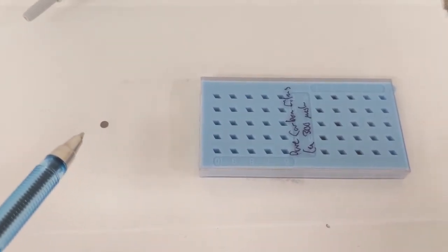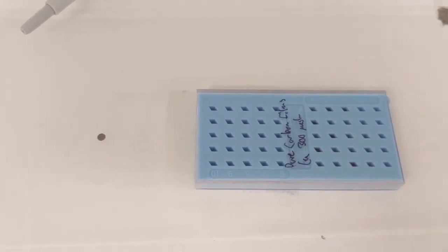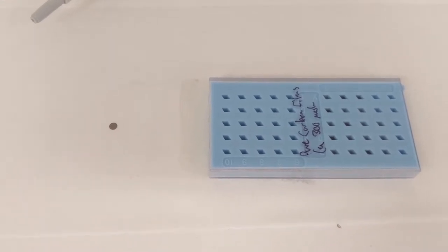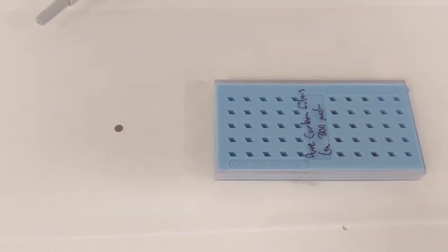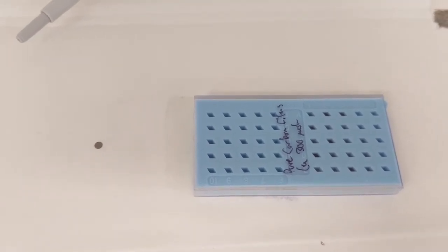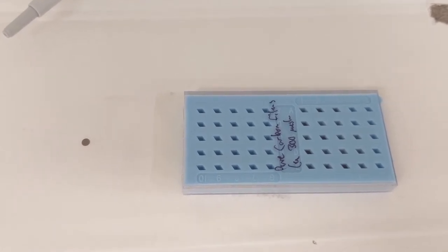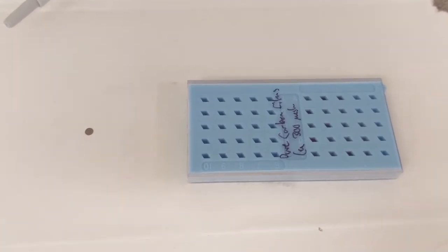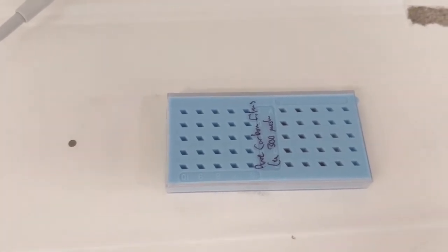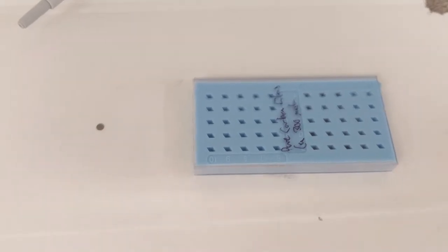This is a TEM grid. This is a 3mm copper disc with a square array of holes. We can see a magnified image of this on slide 3 of the notes. We use the bars created by those holes to support a thin carbon film, which will sit over the holes, and we deposit the sample onto that carbon film. When the solution evaporates, we're left with the particles on the film.